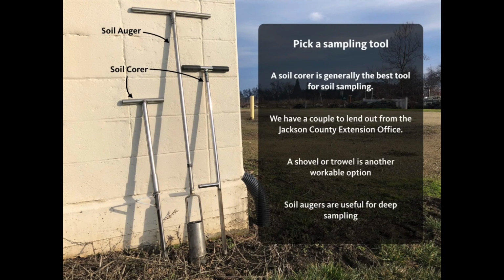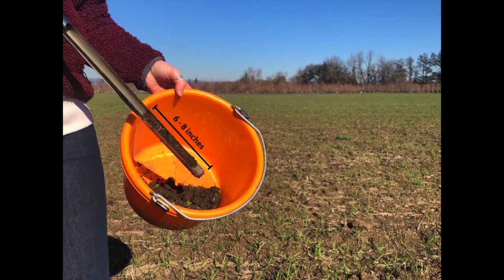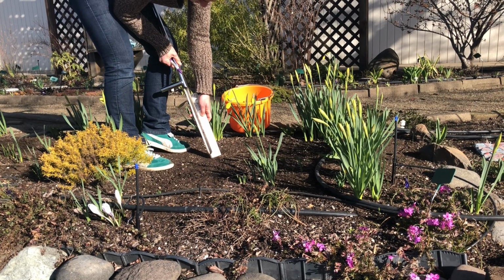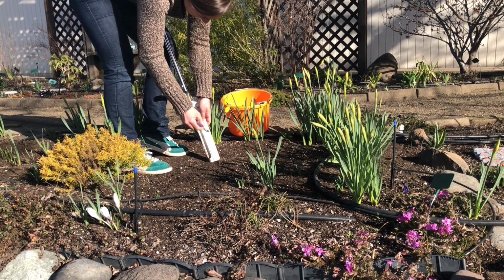We recommend using a corer available at the Jackson County Extension Office. Shovels and trowels can also be used, but you'll see why using a corer is preferred. For routine testing of home soils, only the surface soil is of interest. Choose a depth between 6 and 8 inches, but be sure to remain consistent with whichever depth you choose. Mark your depth of choosing on your soil corer.